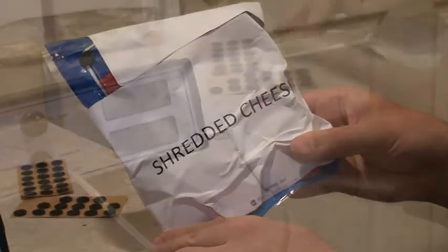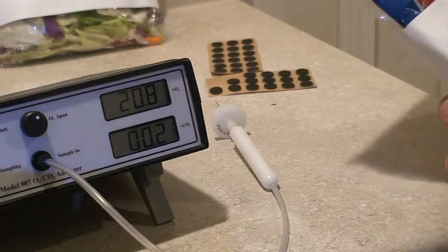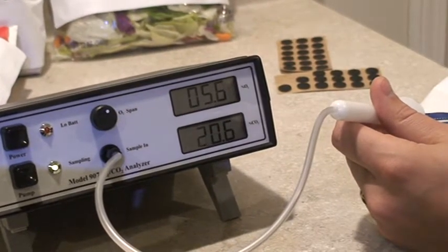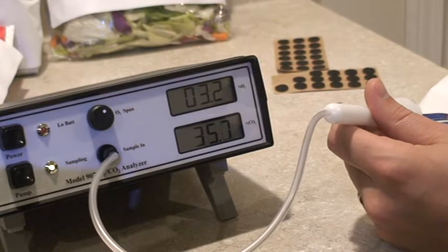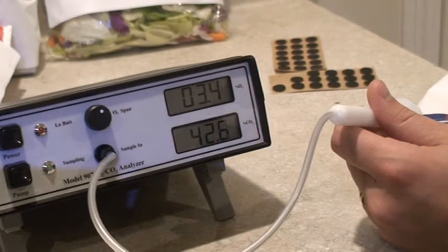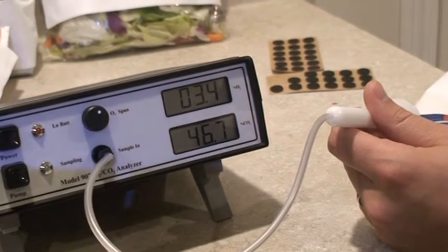Next we're going to sample a bag of shredded cheese. Again we affix a foam septa onto the bag of shredded cheese, insert the needle and filter, and press the pump button. As you can see, you can achieve results quite quickly with this analyzer, and as expected for a package of this type, we are seeing about 3.5% O2 and somewhere in the high 40's for CO2.